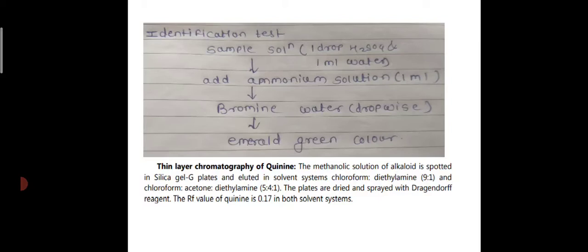Analysis is done by TLC. Why is analysis done? Analysis determines the quantity or quality of a compound, or how much quantity of that compound is effective, and after analysis we compare the value with the standard so that we get the effectiveness of our phytoconstituent.